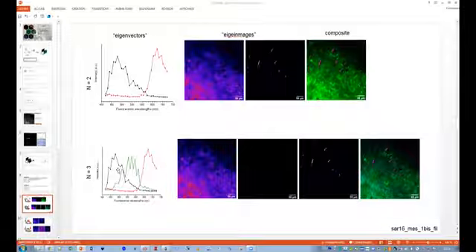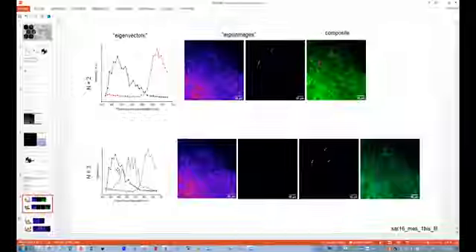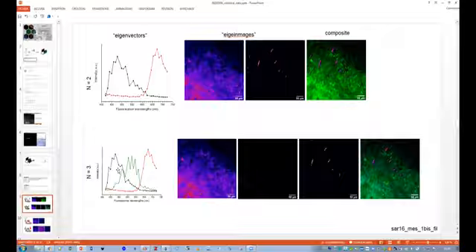If I understand clearly, you can get one eigenvector that is a linear combination of a lot of individual spectra. Yeah. So is it possible to superimpose all of these spectra together with the eigenvector in order to see the diversity and the variability of the spectra of all of the pixels that are represented by a given eigenvector?